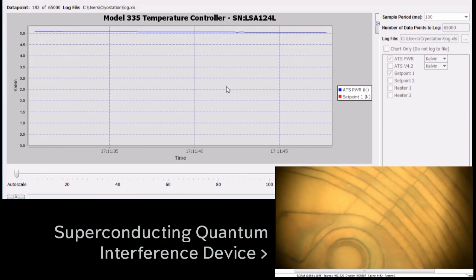To illustrate the agility and the positional stability of the Agile Temperature Stage, I'm going to change the temperature on the platform, which is currently at 5 Kelvin as you can see in the thermometer plot, to 50 Kelvin.